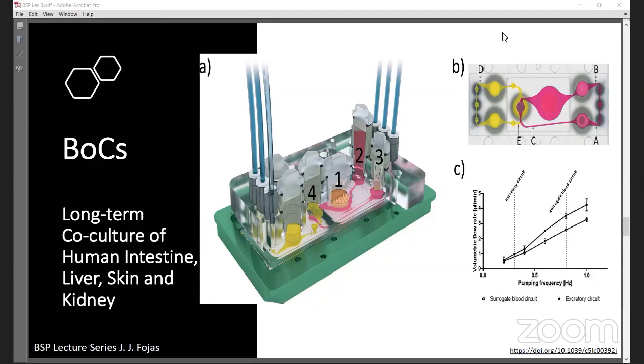It's quite cool, actually, and it's not obvious in the image, but in this study, they used a peristaltic on-chip micropump to ensure pulsatile media flow interconnecting the 4 tissue culture compartments through your microfluidic channels. And then they have a second microfluidic circuit that ensures drainage of your fluid excreted by the kidney epithelial cells. So basically, they also tried to assure that the physiological fluid to tissue ratios are maintained.